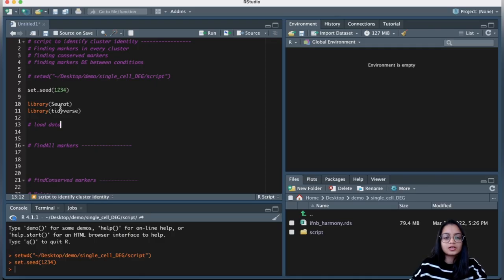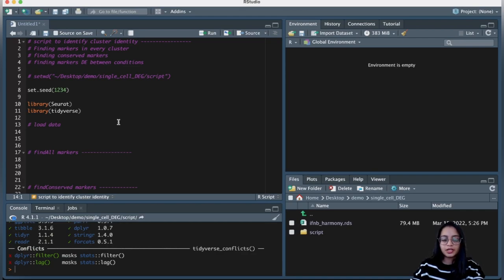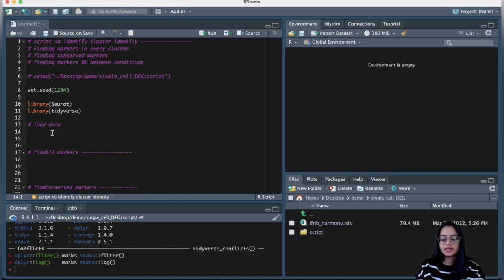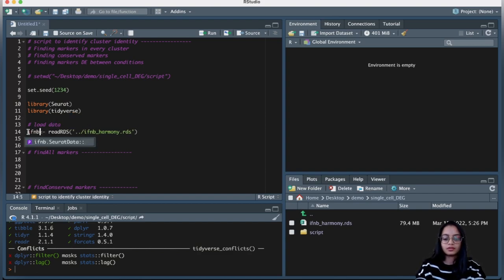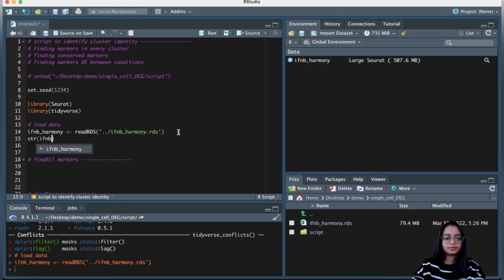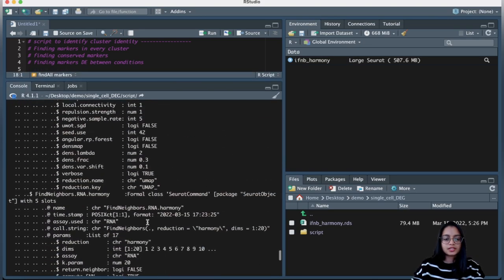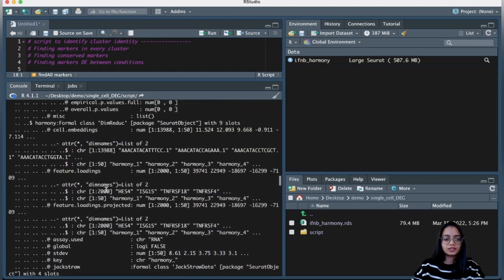Let's switch to RStudio to get started. We begin by loading libraries and loading the data. In the previous video we performed integration using Harmony and ran downstream steps like UMAP and clustering. We will use the same data today, saved as an .rds file. We will read in the .rds file using the read_rds function, providing the path and filename, and assign it to a variable. This processed data with dimensionality reduction steps applied will be our working dataset.